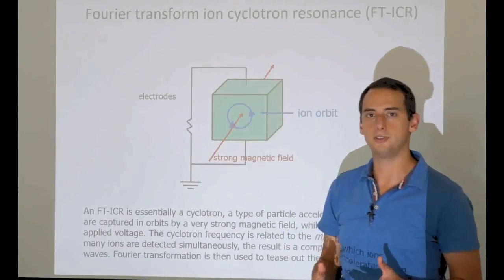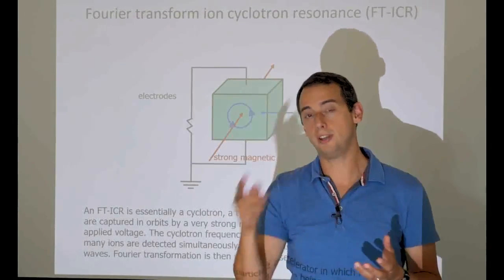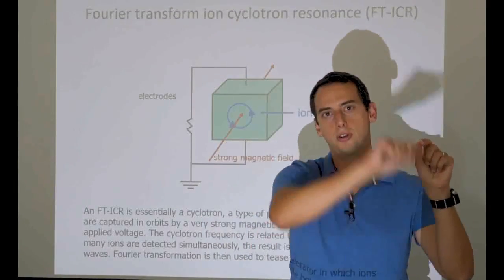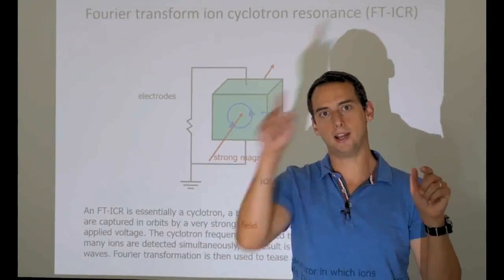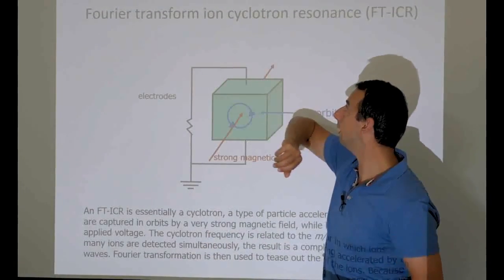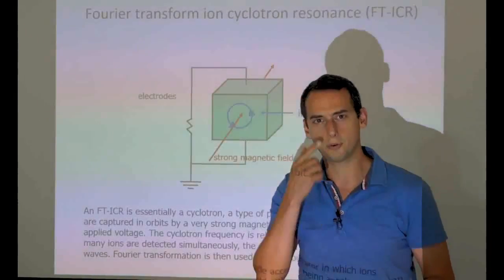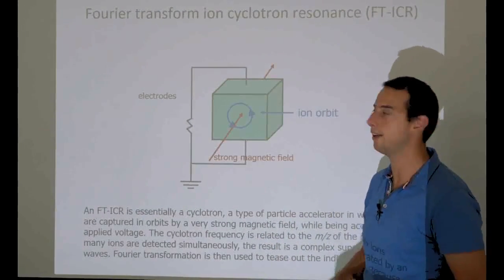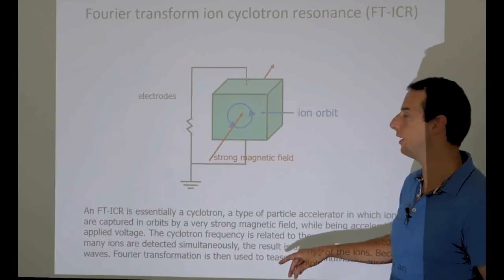So an ion cyclotron is a very fancy device that uses magnets, very, very powerful magnets, that of course influence electrically charged ions, by forcing them to move in a circular path. And it's an endless circular path, so they keep cycling through the electronics. It's a cyclotron. The electronic components make the ion cycle. So an ion cyclotron. Very big ones are built at CERN in Switzerland. As you may know, in Geneva, the Large Hadron Collider is essentially a really big cyclotron. These, of course, are a little bit smaller, but they're still very sophisticated.